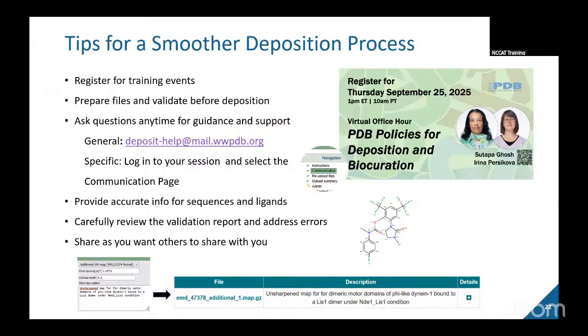You can? Yeah, it's not what we're showing to you when you're at rcsb.org, but you can through FTP, so I could send instructions about going in. Or access them from the website? No, not directly from the public websites. But the preprint structure, that's accessible to the reviewers, right? I assume usually you supply your coordinates and maps for the reviewers.